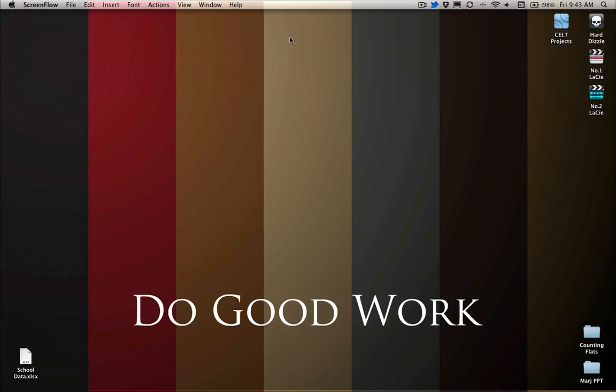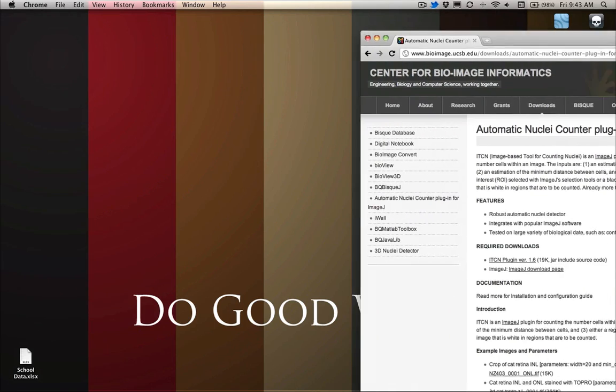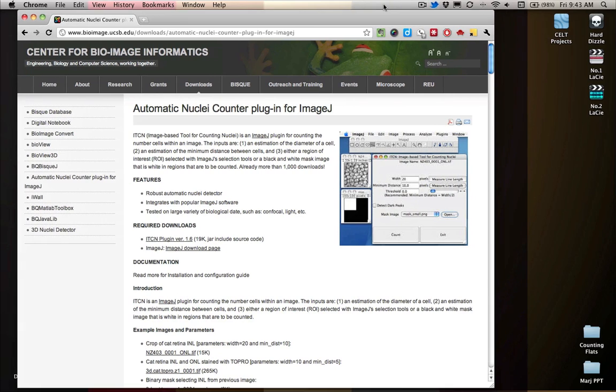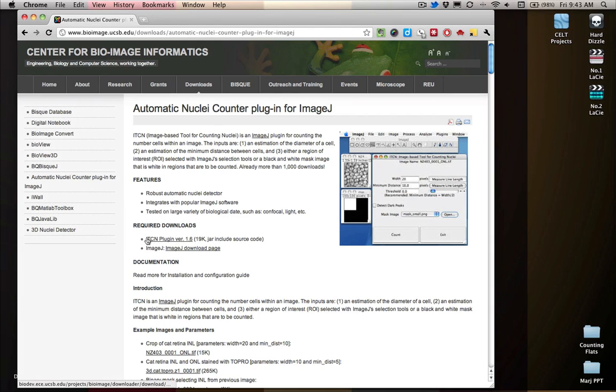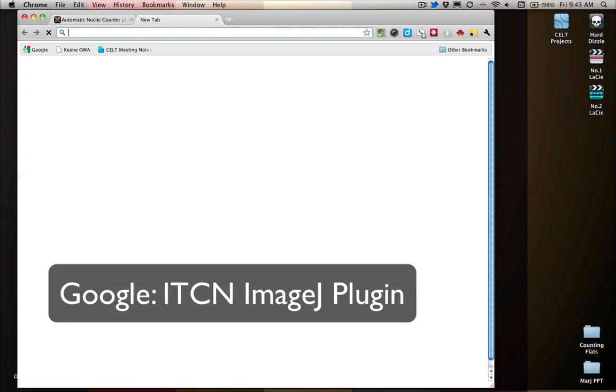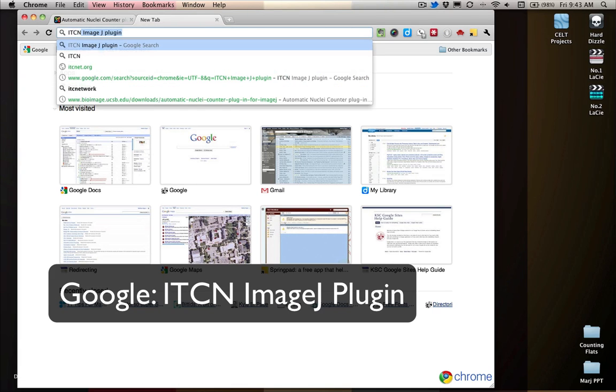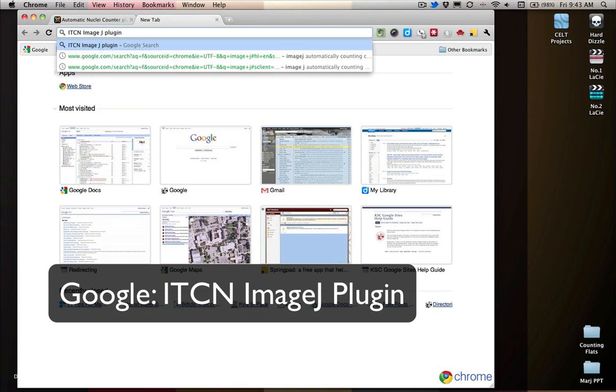So before we get started, one of the things that you're going to need is you'll need the automatic nuclei counter plugin for ImageJ. The easiest way to find this is just do a Google search for ITCN ImageJ plugin.